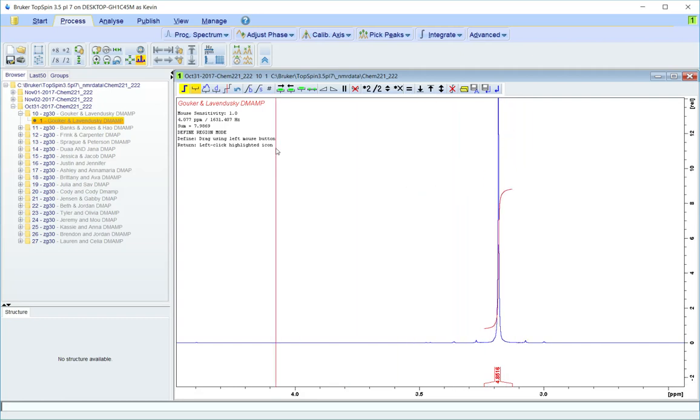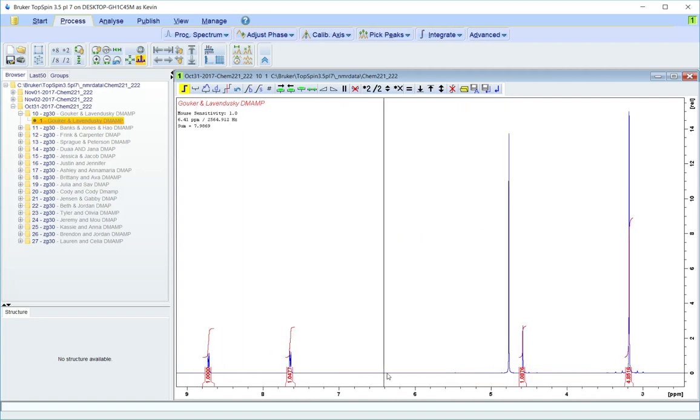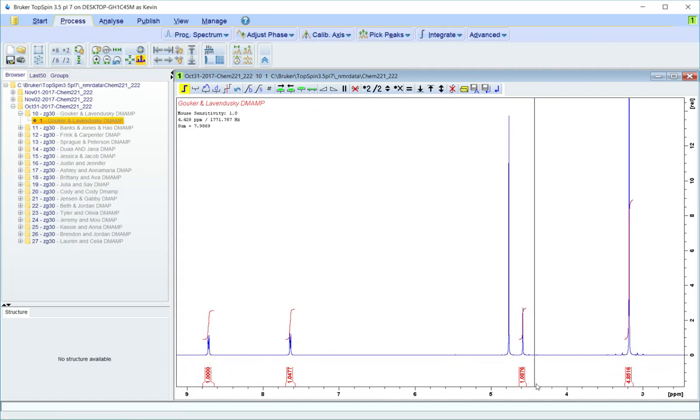All right, so you've got all your integrals selected. And so I'm gonna uncheck this icon or deselect it so it's no longer yellow. And I'm gonna zoom back out so I can see kind of everything here. So there's 4 peaks in this particular compound, and right now the spectrometer gave them a 1 to 1 to 1 to 4.8, so maybe that's 5, maybe that's 4.5, we don't really know, but we'll deal with that later.